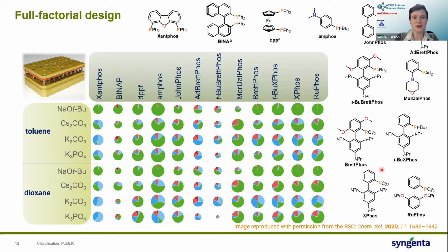But another useful visualization for me that I'll always do pretty much is to look at just different charts of how each of these ligands is affecting what's going on, to try and tease out combinations of variables, that sort of thing. And of course, to look at the quantified yield results, if I have them, and how those are affected by everything else.